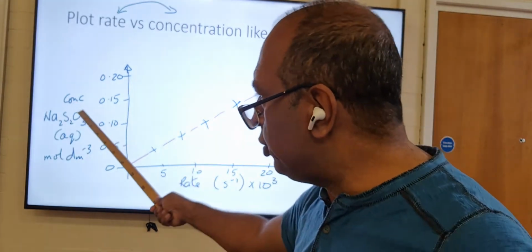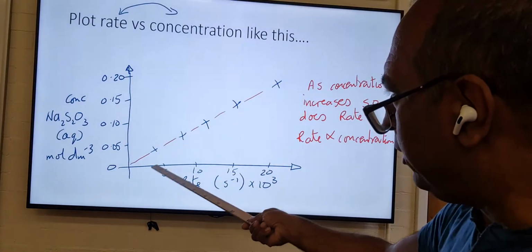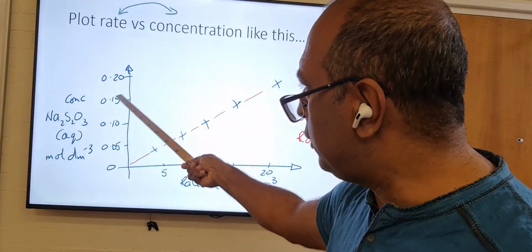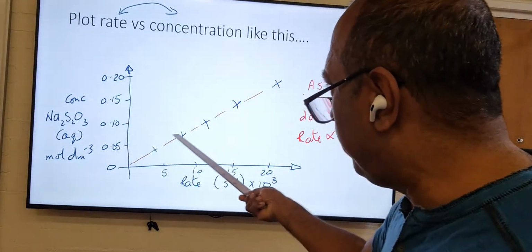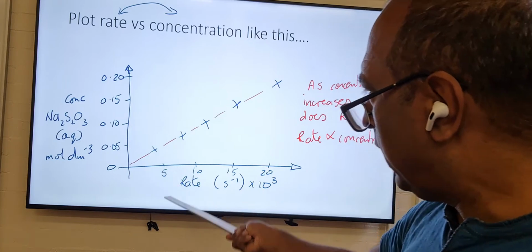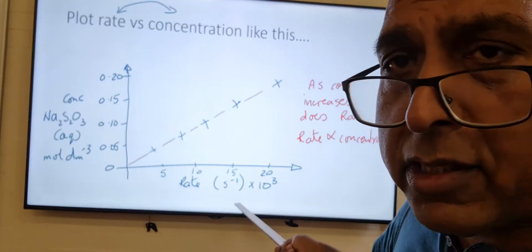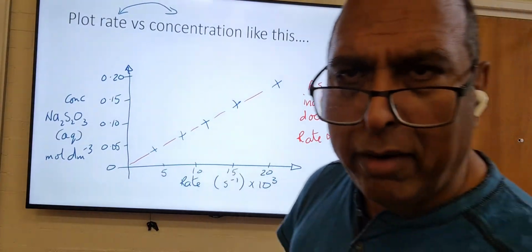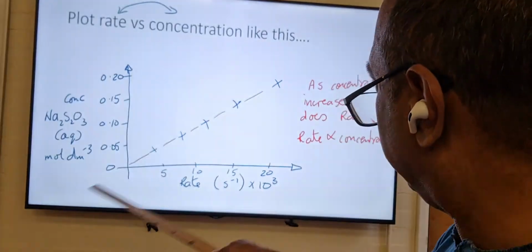I've done concentration versus rate. And they are my values roughly. See, the concentrations were 0.20, 0.16, 0.12, 0.08, 0.04, and I got these values for 1 over the time. And that seemed, on my rough sketch, really quite a good experiment.